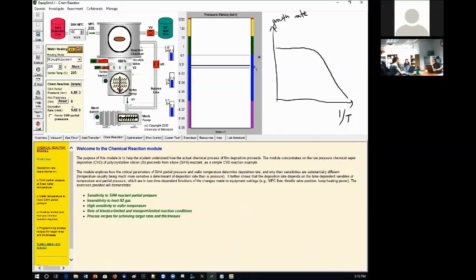225, 10 to the minus 9. These are still very, very little. I mean, I'm not really growing anything. Okay, so let's do something real because it's going to take quite a while to get these temperature readings.